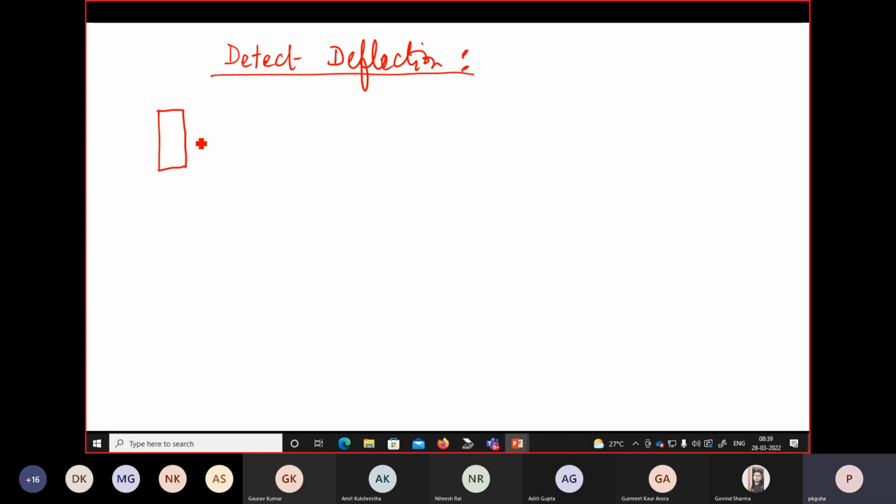So this is my cantilever. One of the techniques: there is the cantilever and then there is a probe. This particular technique is known as the Binnig method, because Binnig is the person who first developed the STM and then the AFM. So he tried to extend the STM method here.